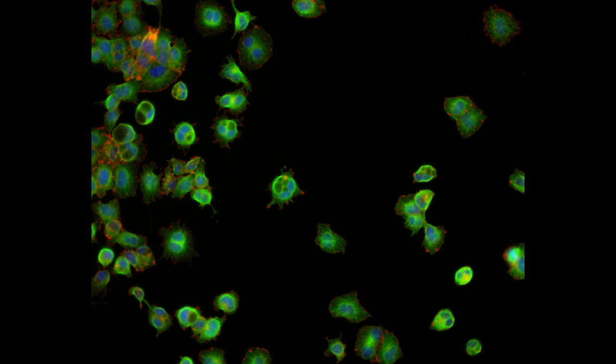The original image folder contains the original RGB images. Typically, the original RGB images present a gray level image in the blue channel referring to nuclear staining, for instance DAPI, an image in the green channel referring to GFP signal, and an image referring to RFP in the red channel, but this is absolutely arbitrary.